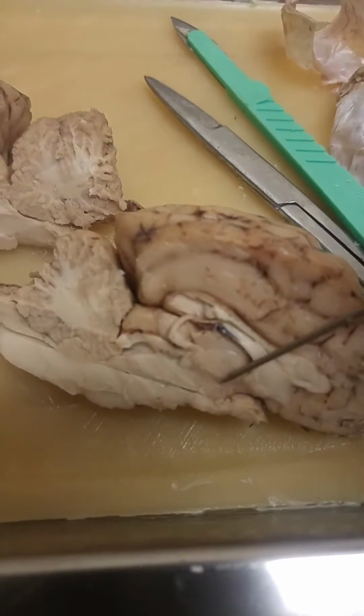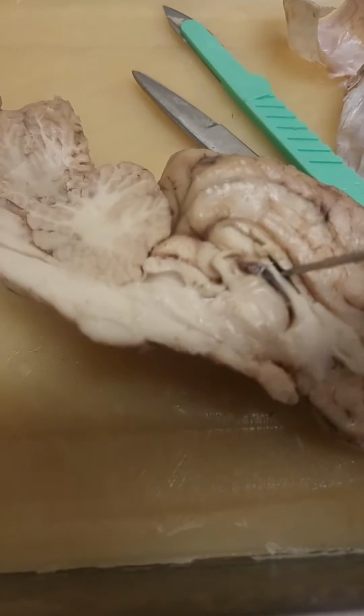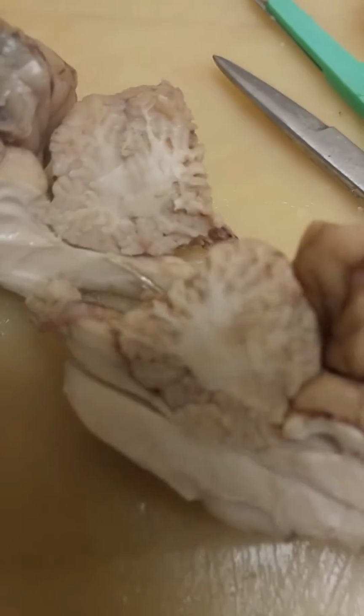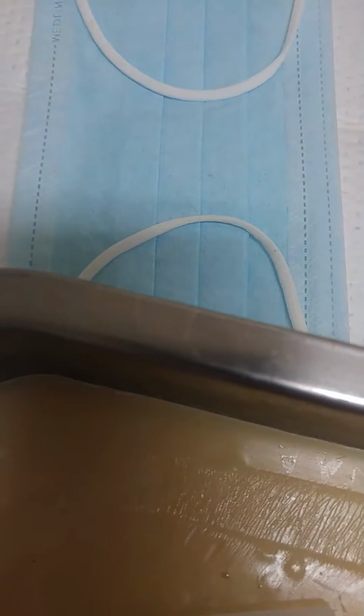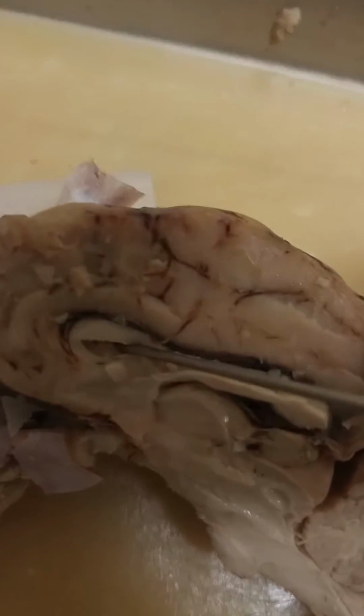Below the thalamus would be the hypothalamus, and then the lateral ventricle is inside, or well, just underneath the corpus callosum, and there's a very thin membrane that separates the two lateral ventricles, that is the septum pellucidum. Within the lateral ventricle, let's see if I can get it open here. Within it, just at the top here, would be the choroid plexus.